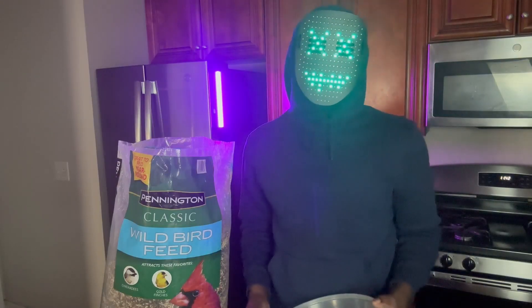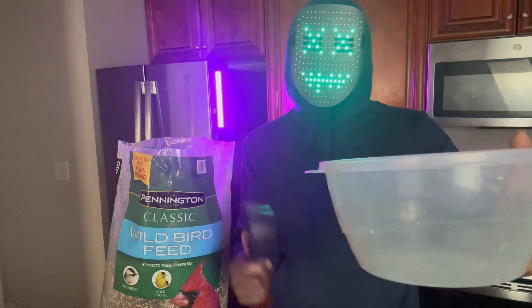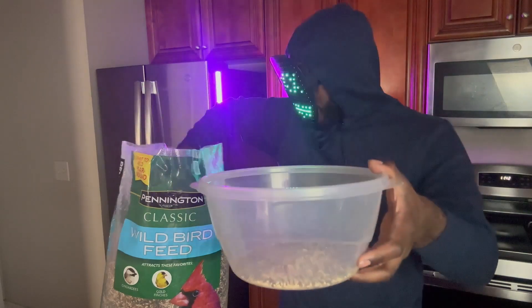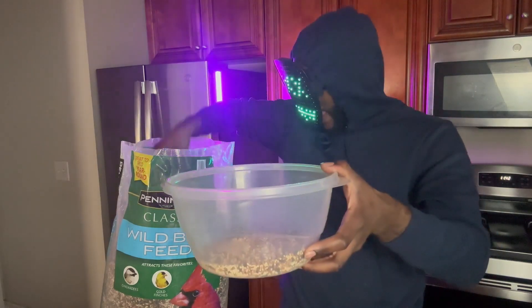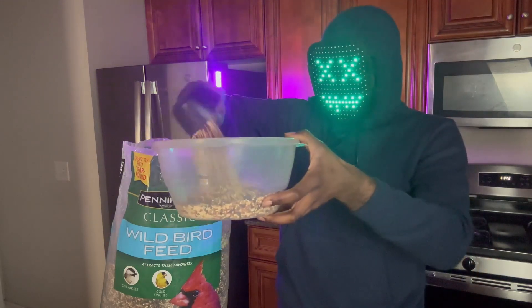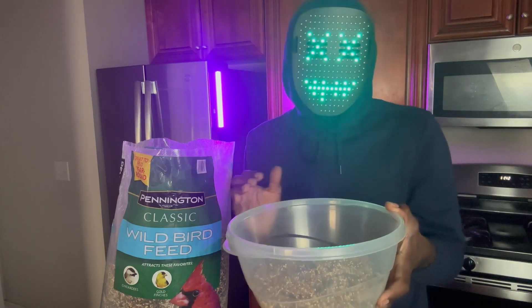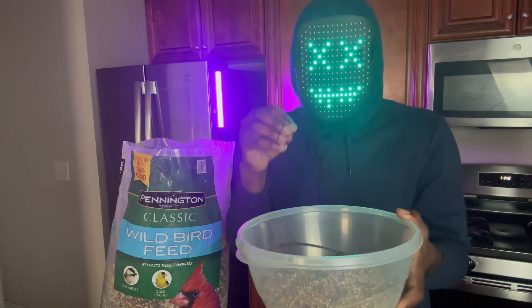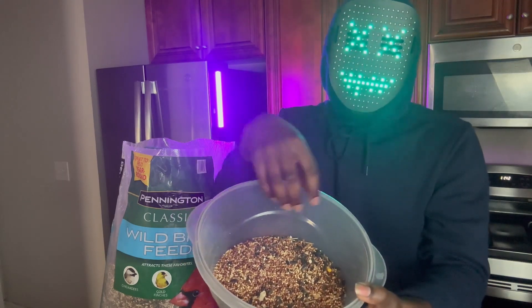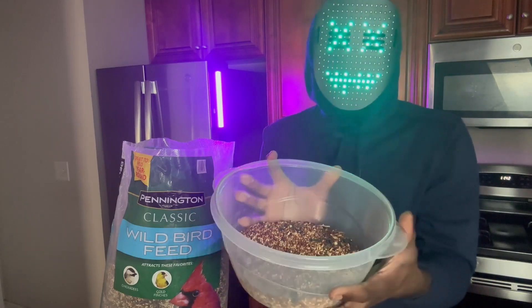We've opened up our bag of bird seed. Now let's take our large Tupperware bowls and our one-cup scooper and put them to use. What we're going to do is add four cups of grain out of our bag. The reason I only add four cups of grain in each Tupperware bowl is because when I go to add water to my wild bird seed, I want the grains to be able to move freely throughout the bowl.